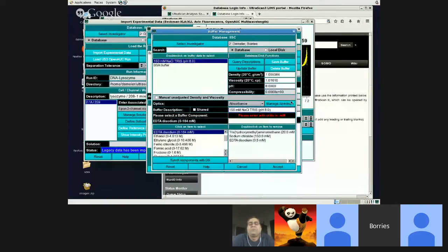Another thing you can do is, yeah, go ahead. I'm having a problem here. I'm not able to save my buffer. You have a problem with what? It gives me an error message when I try to save the buffer. Okay, do you have the database set up correctly yet? Yeah, I did that. Okay, and you're trying to save the buffer, and it says what? Error updating buffer in the database. MySQL no rows returned.